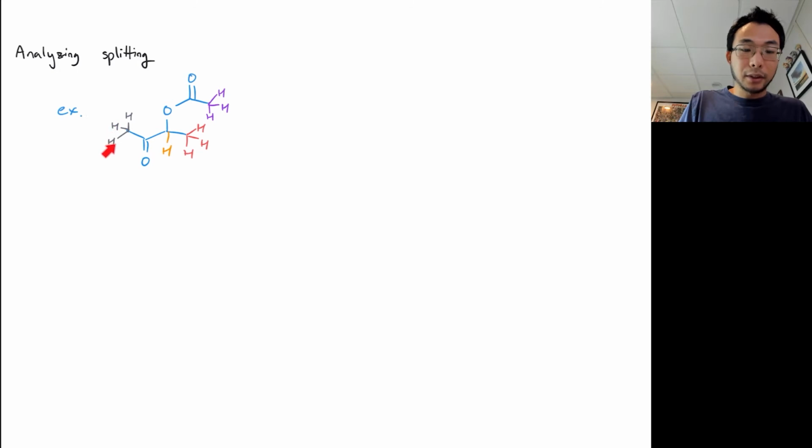These 3 hydrogens are also identical to each other, so I don't need to worry about them coupling to themselves. So I expect the signal for these 3 hydrogens to show up as just a singlet, or S. If I look at the top right in purple, those 3 hydrogens are in the same situation, where there are no 3J couplings or 4J couplings, so another singlet.